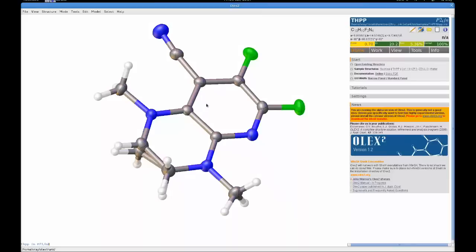So I should really explain why I'm doing this. Well, I'm doing this because I'm making these tutorials for Olex2. Now Olex2 is a refinement, solution and analysis package, not in that order, but for crystallographers and chemists, and pretty much is a great program. It runs on Windows, Mac and Linux, and the source code's out there if you want to get hold of it.